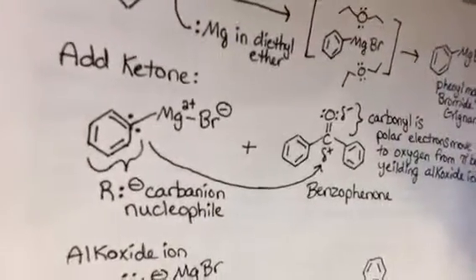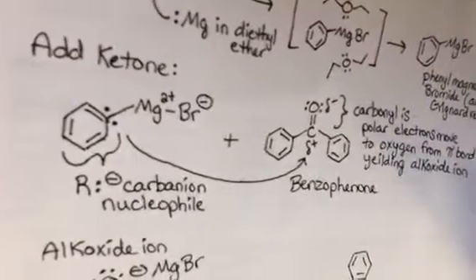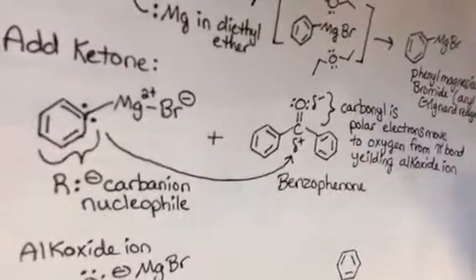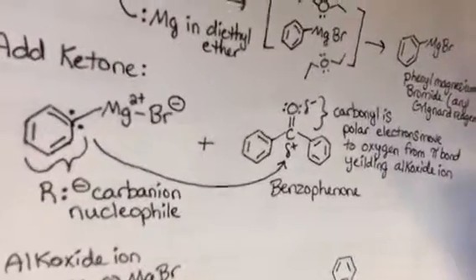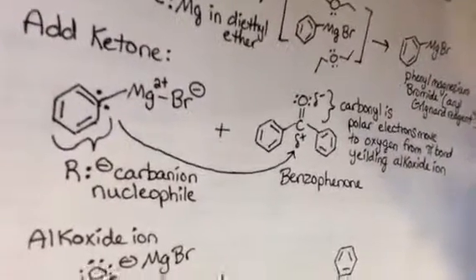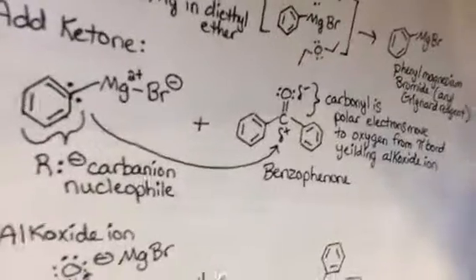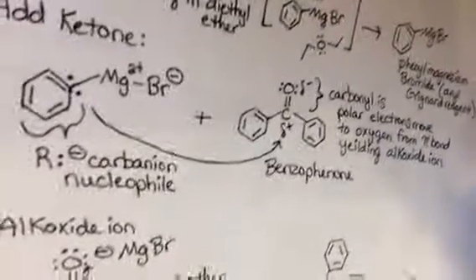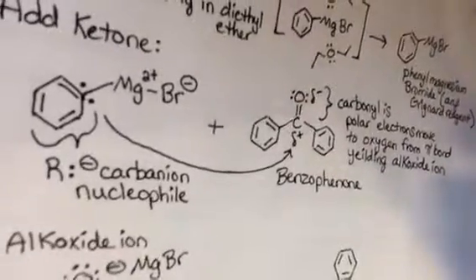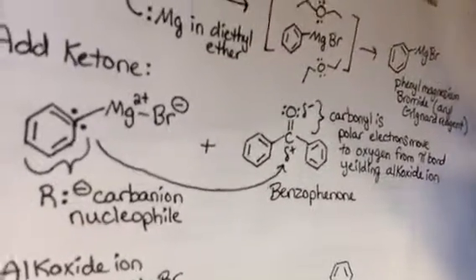So as you can see, that carbanion is nucleophilic and it's also basic, which means it's very sensitive to protonation, which is very important to the yield of your product. In fact, that's probably what affected my low yield of product, was early protonation of that very sensitive carbanion.